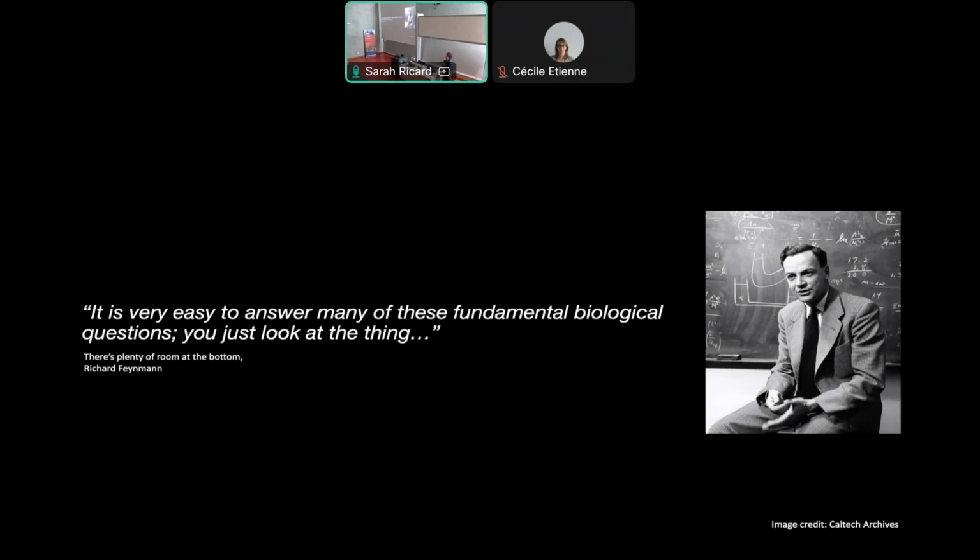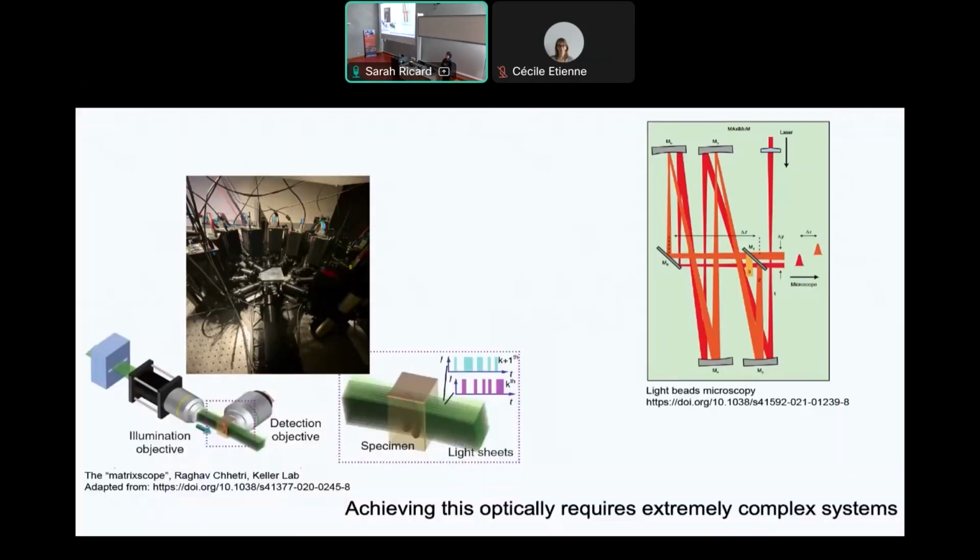And now I'll switch tack to a topic that I'm personally very interested in. Traditionally, what we've done in microscopy in general is to say, okay, here you've got a problem. You want to look at everything everywhere all at once. Okay, you need this field of view, you need this imaging speed, you need this resolution. Okay, I'll come up with an optical design that allows you to do that. But maybe there's a better way that we can go about designing.